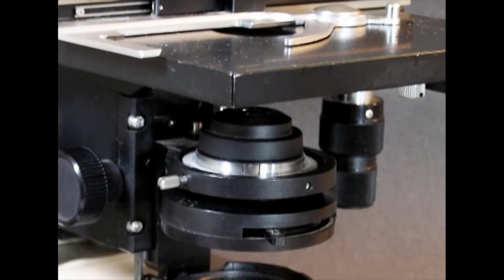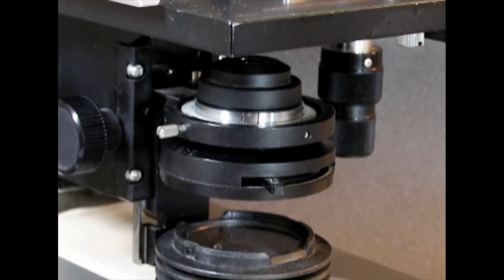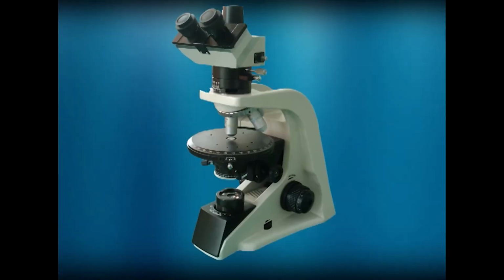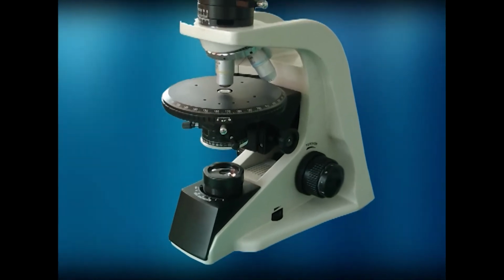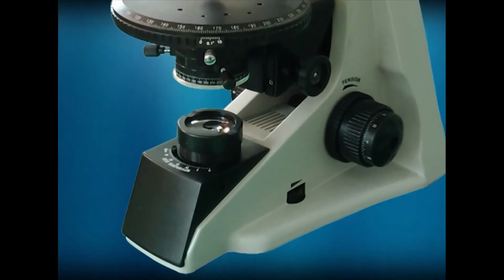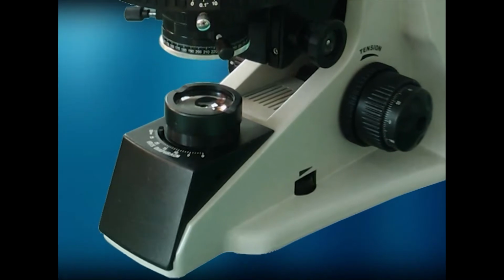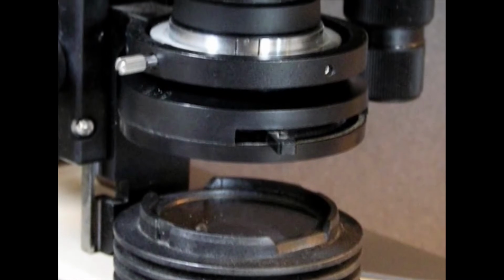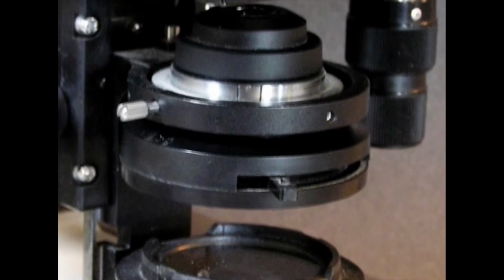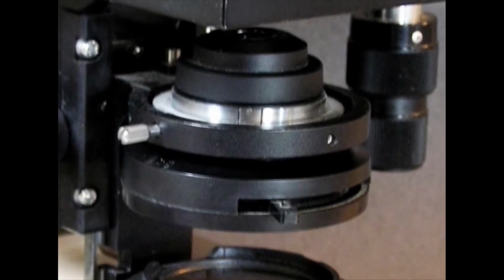The sub-stage apparatus is below the revolving stage and consists of the lower Nicol or polarizer, an iris diaphragm and a condenser. The sub-stage apparatus can normally be swung out of the light path or be completely removed by lowering it to its minimum position. The condenser consists of two simple lens elements and its function is to supply a cone of light just large enough to fill the front lens of the objective completely, giving maximum illumination.